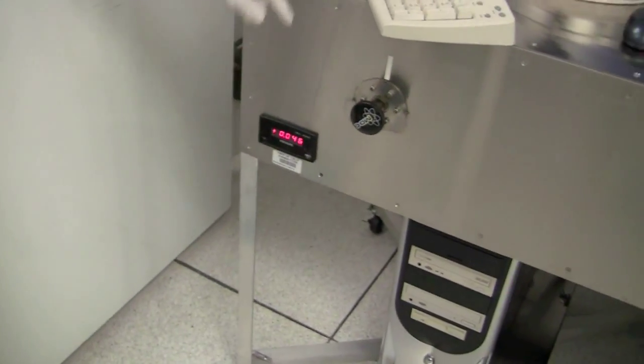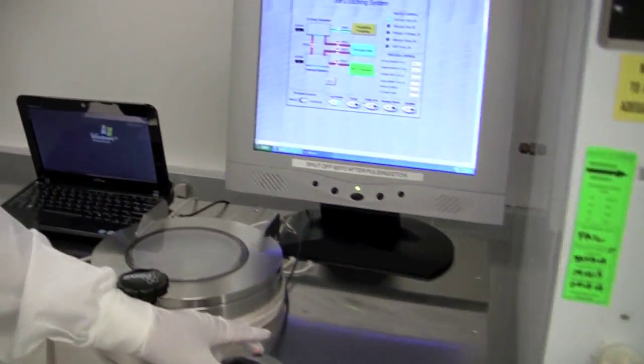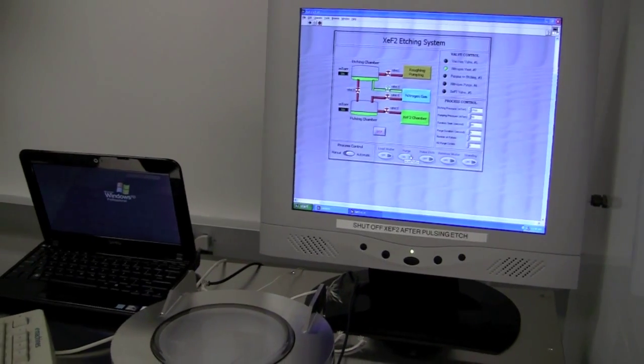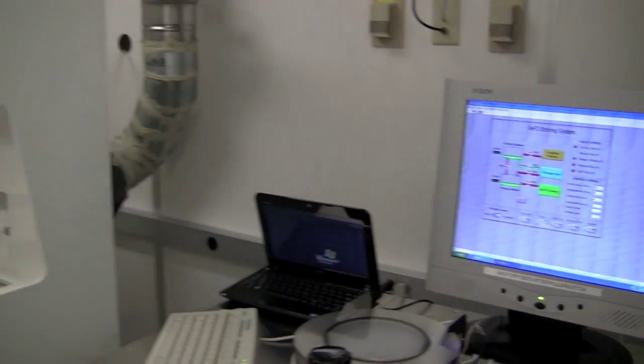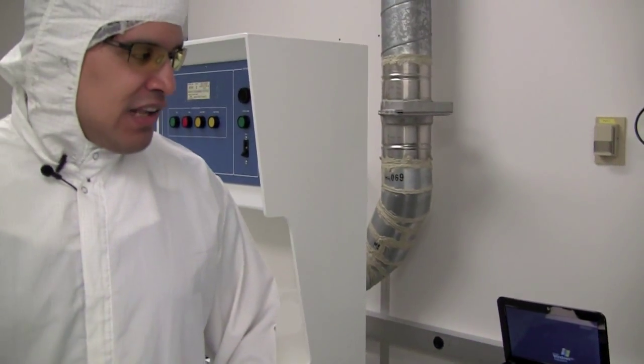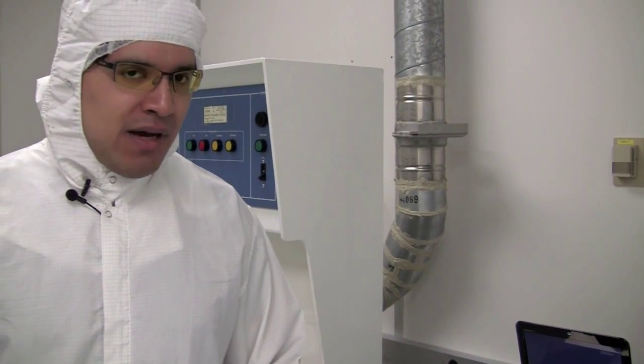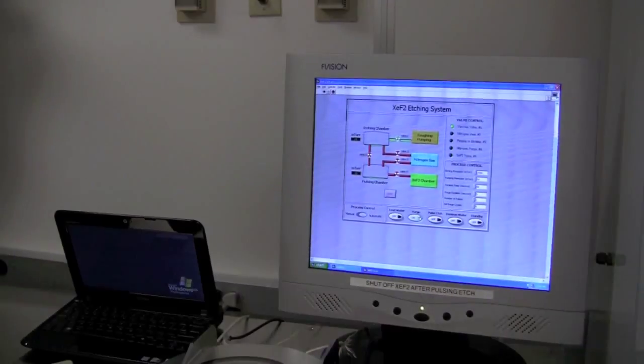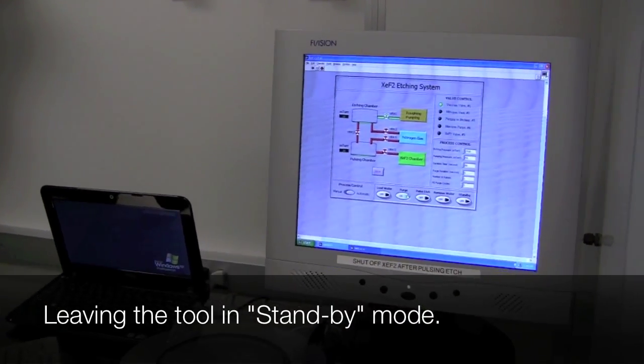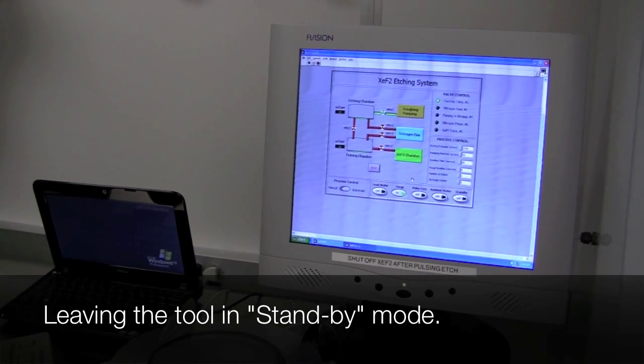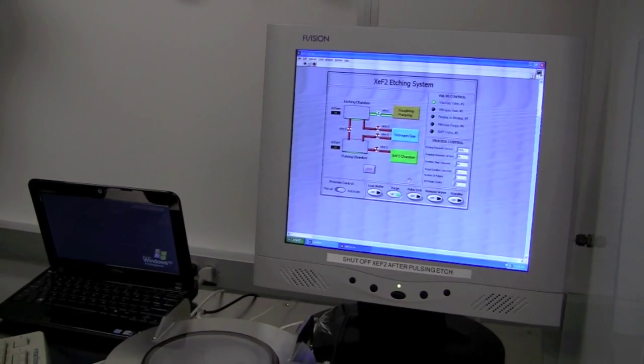As you can see, our chamber has already dropped below 50, so we'll just hit purge again. I like to purge in case there's any moisture that got in the chamber, just to get it out. But technically you can just hit standby, but I like to practice purging. Once it's done purging, and everything has been cleaned up, the bottle is closed, you filled the logbook, and everything is done, you can hit standby.